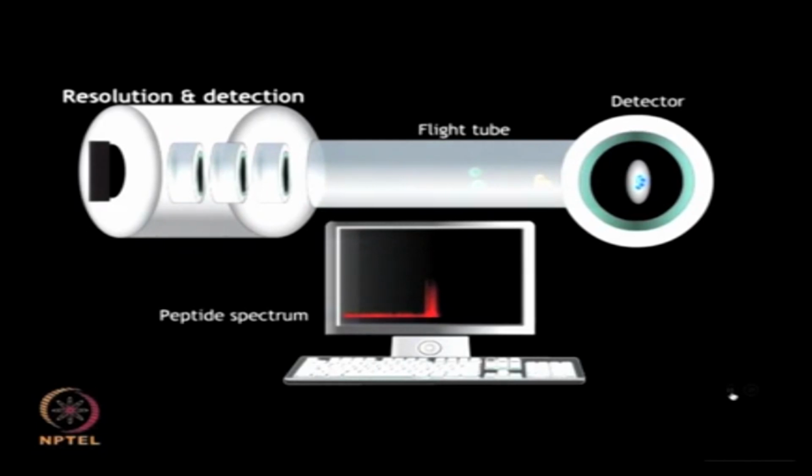These ions are resolved and detected on the basis of their mass to charge ratio, and a mass spectrum is generated. Parameters such as geometric design, power supply quality, calibration method, sample morphology, ion beam velocity, etc. all of these factors affect the accuracy of mass detection.